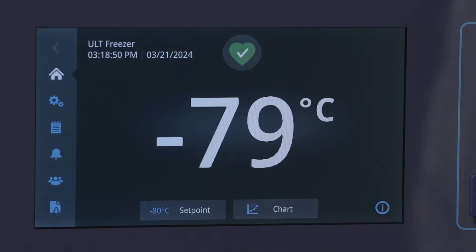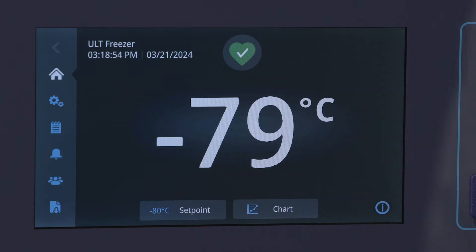From the home screen you'll see the current temperature of the freezer, the navigation menu, and quick access settings.